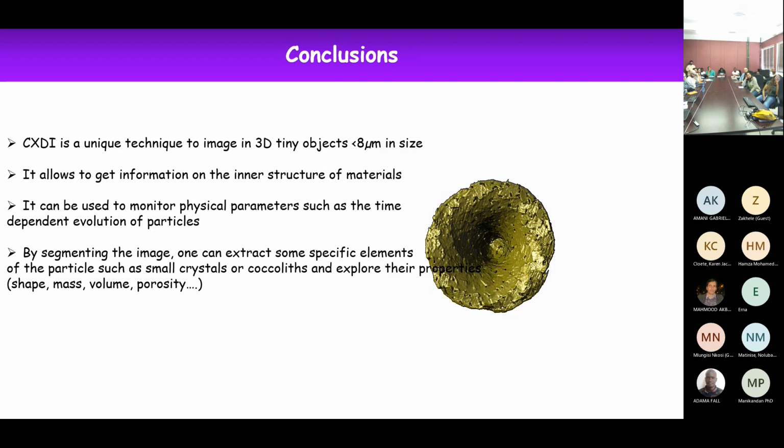Well, we have tried to look at the shape of this trumpet and to send a beam of light, just a normal light, visible light. And what we have been able to see is that the trumpet is concentrating the light onto the cell. So basically, this trumpet has a function which could be just collecting the light onto the membrane. So you see, it is a very interesting system to be studied.